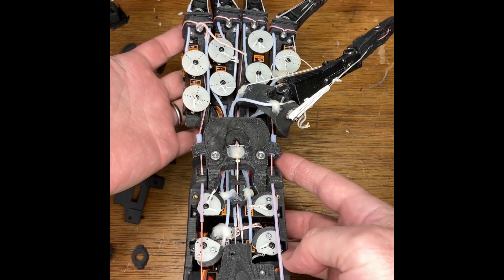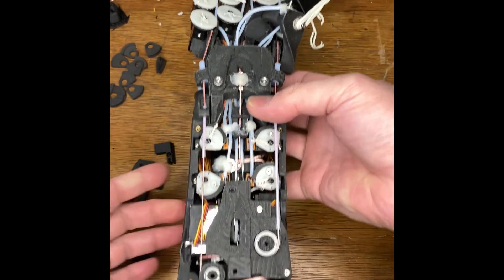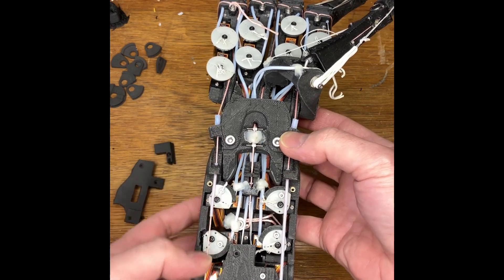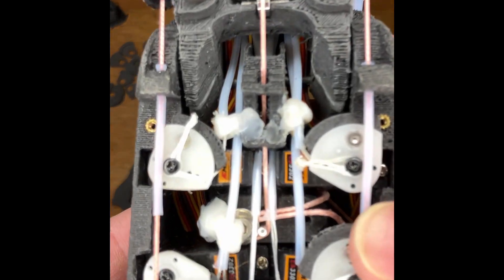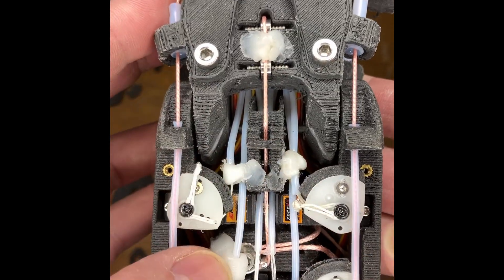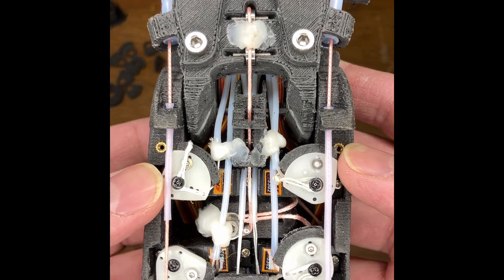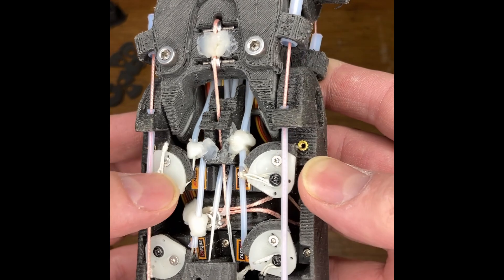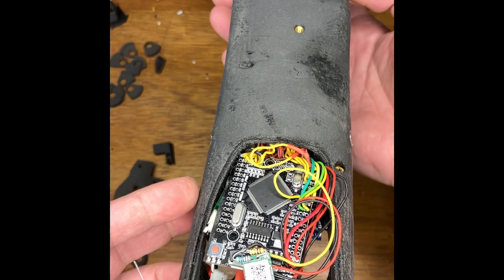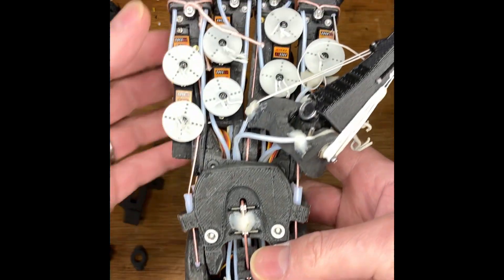Going to go over some of the points that were covered in the CAD video with the real hand, what's left of it. These corrections have been done and are now in the CAD. This is added to the CAD and STL files, and this is still to be done. Trent from IoT Design Shop has, I believe, designed that plate, so I'll have a look at that. Plan to do a finishing of the v1.0 early in the new year, and that will coincide with the release of all the instructional videos. At some point after that I assume there'll be a v1.1 if there's enough interest.